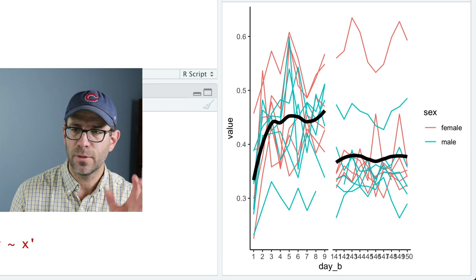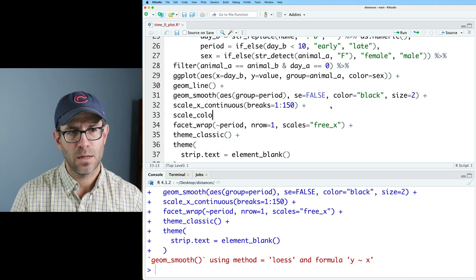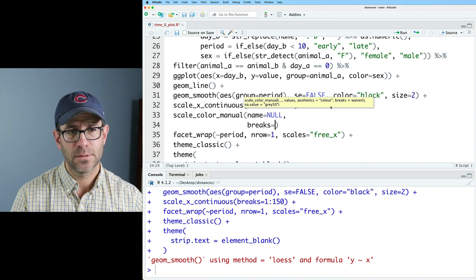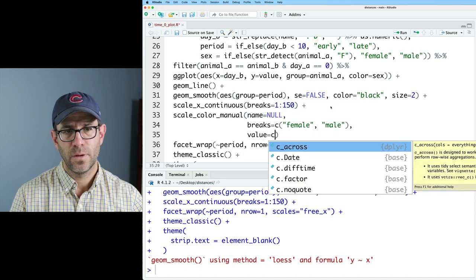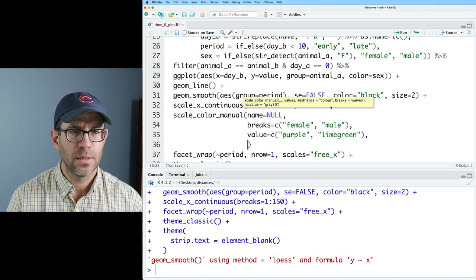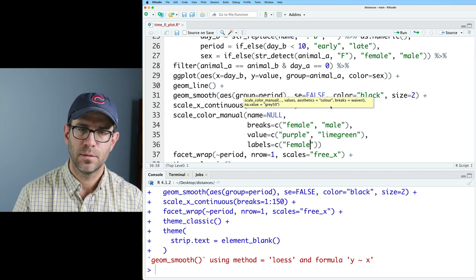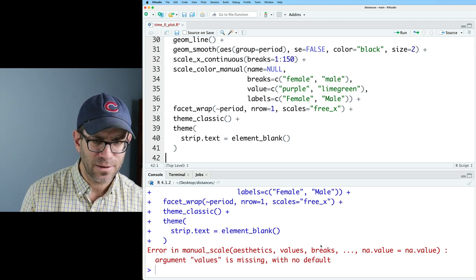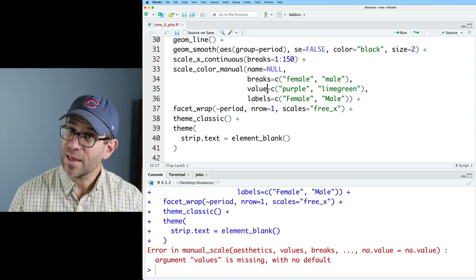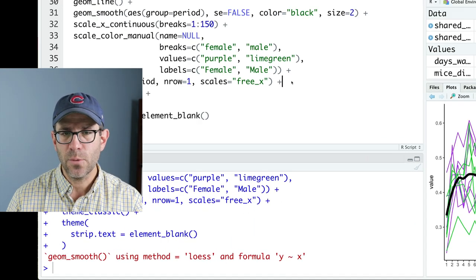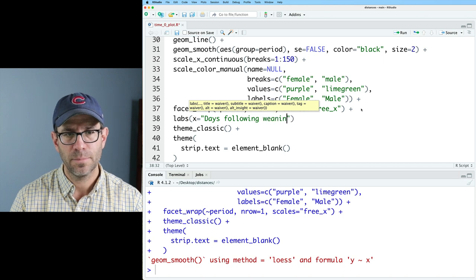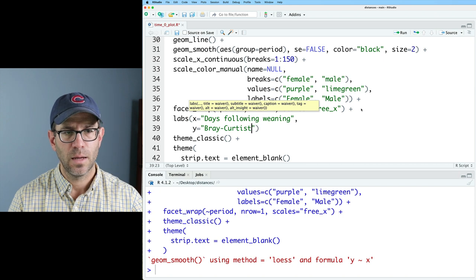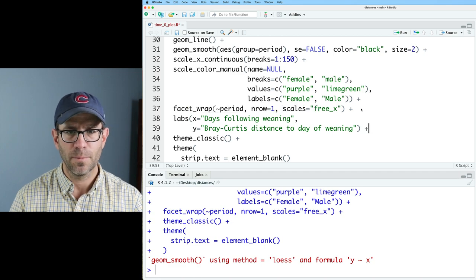Let's go ahead and clean up the colors a little bit to match what we had in the previous episode. I can come in here and do scale color manual and we'll again do name equals null and then breaks female and male and then value of I think we had purple and lime green and then we also have labels of female and male. And it's upset with me because it says our error here argument values is missing with no defaults because I put value rather than values. Very good. So now we've cleaned up the color and this color scheme matches what we've had previously. So now we need to go ahead and clean up our axis label. So we'll do that with labs and X will say days following weaning and then Y will be Bray Curtis distance to day of weaning. Okay. And a plus sign on that.